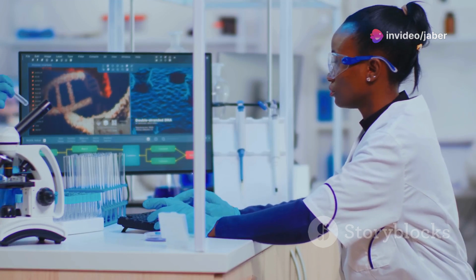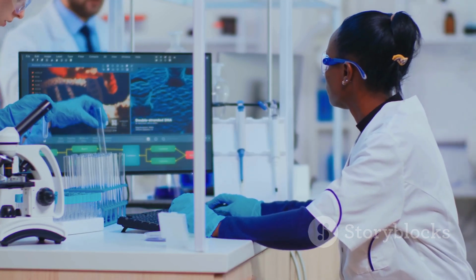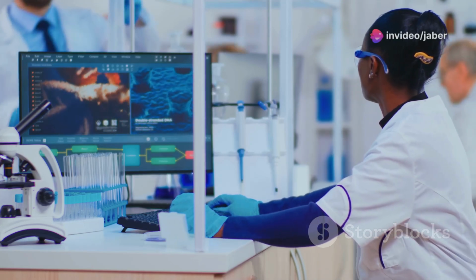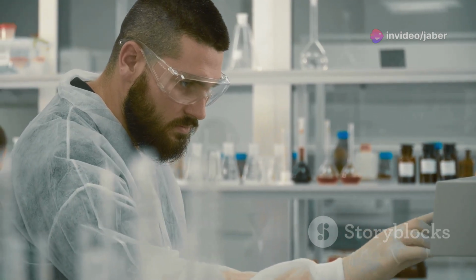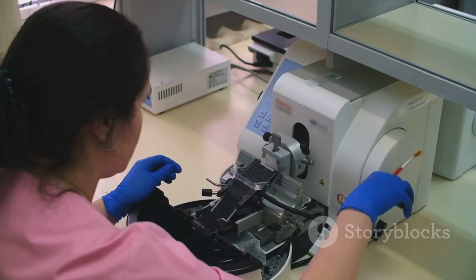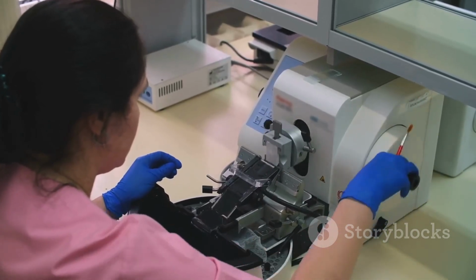Batch effects are like those oven variations. They can introduce unwanted variability into the data, making it difficult to distinguish true biological differences from technical artifacts. Batch normalization helps mitigate this problem by adjusting for batch-specific effects, ensuring that the data from different batches are comparable. It's like recalibrating the ovens to ensure a level playing field for all the bakers.